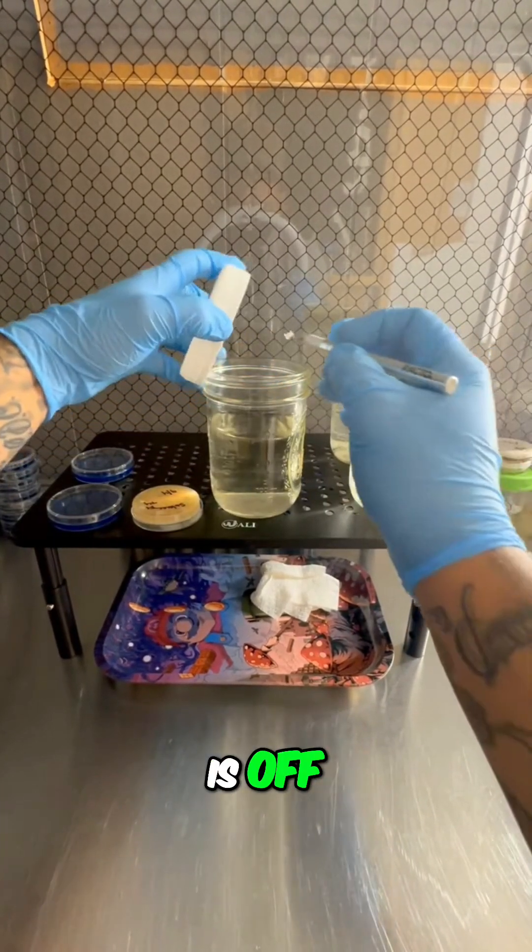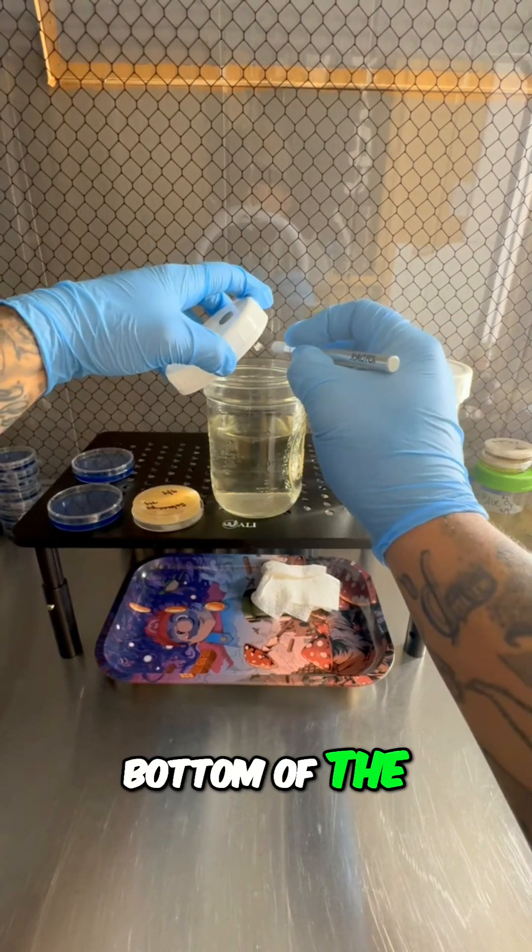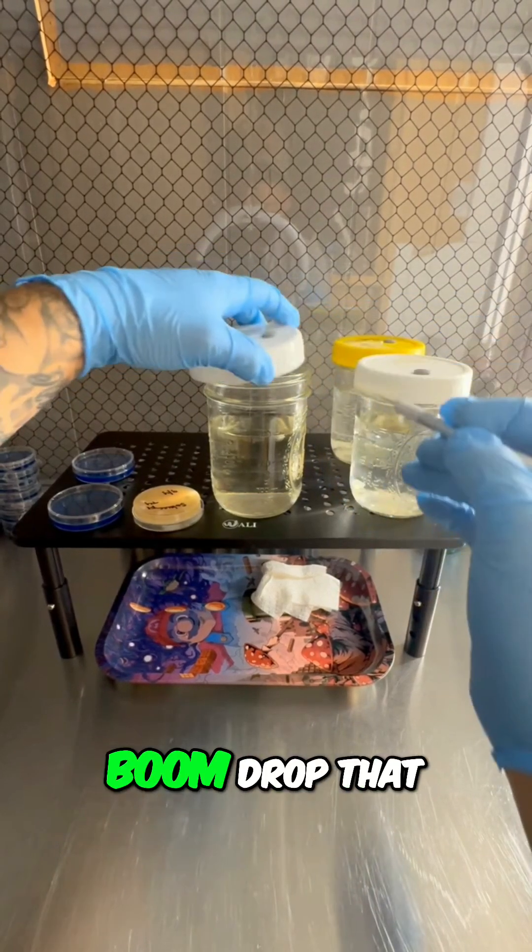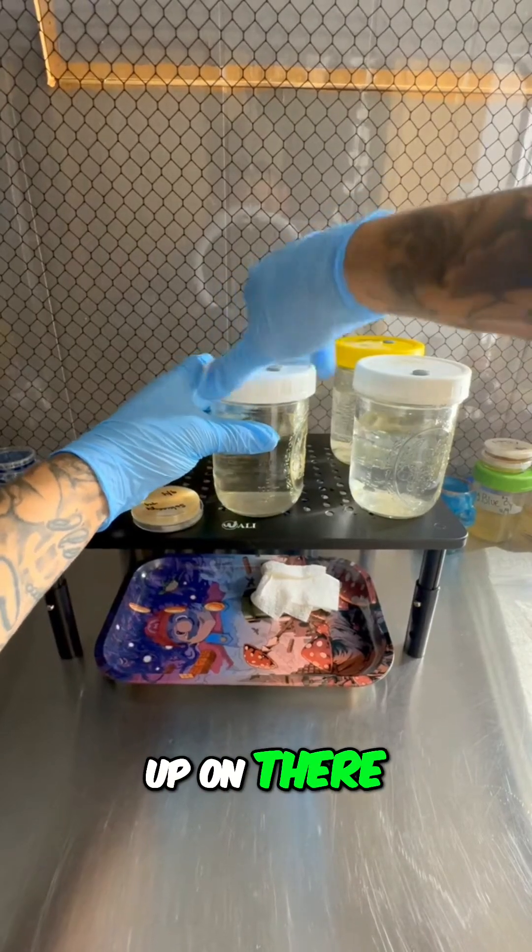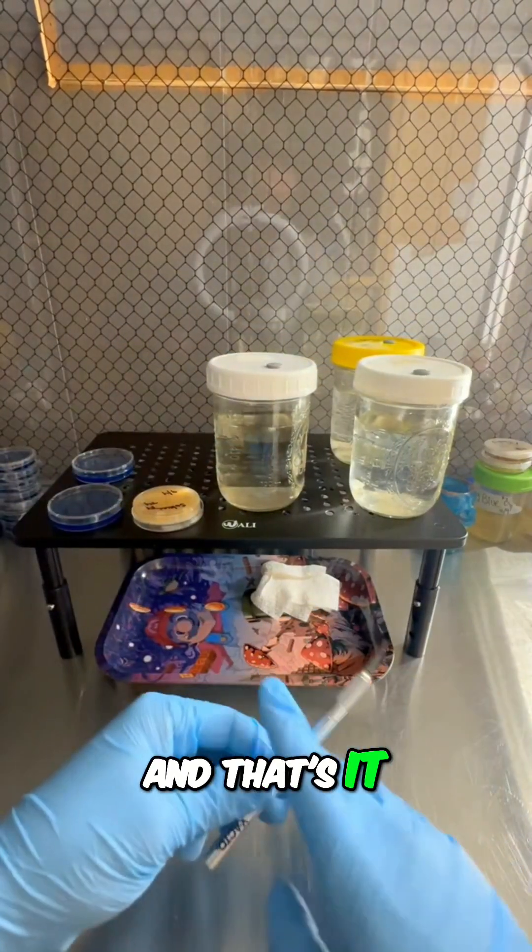Make sure your lid is off and you can use the bottom of the lid if you want. Drop that in there, go ahead and twist it up on there. That's it.